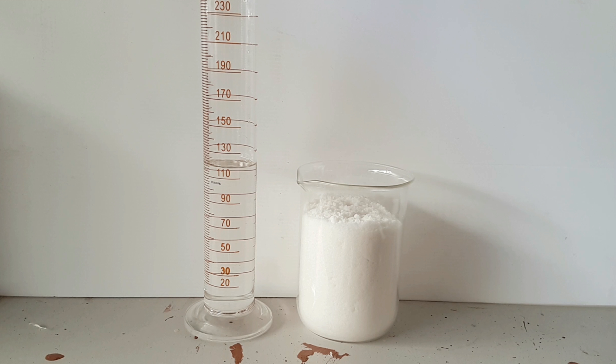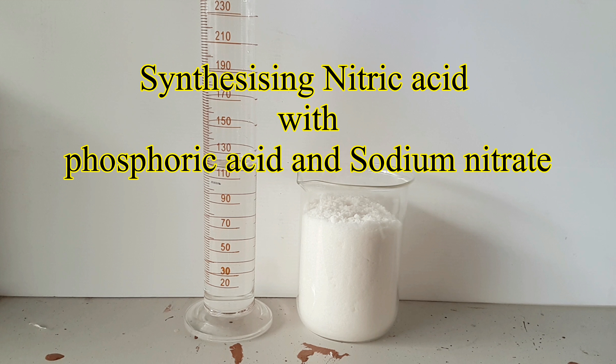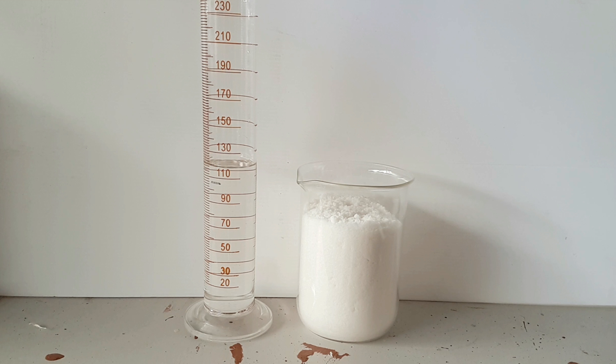G'day and welcome back to the lab. In this video I'll be synthesizing nitric acid by using phosphoric acid and sodium nitrate. Normally I would use concentrated sulfuric acid, but this time I will try a different approach using a cheaper and more easily obtainable chemical.